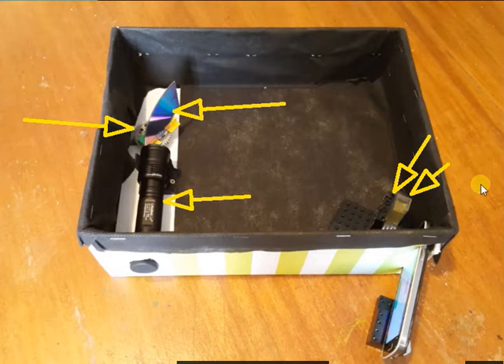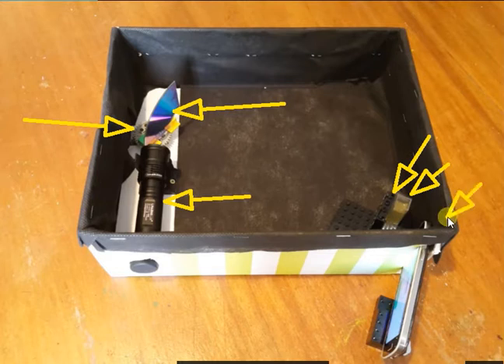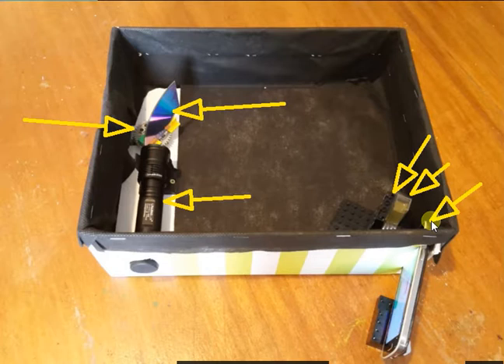Importantly for the spectrophotometer to be of value you need a method of measuring light and calculating absorbance of your sample compared to a calibrator. That's done by this smartphone here where the light sensors are lined up as well as I can get it to the beam of light that's going through the sample.